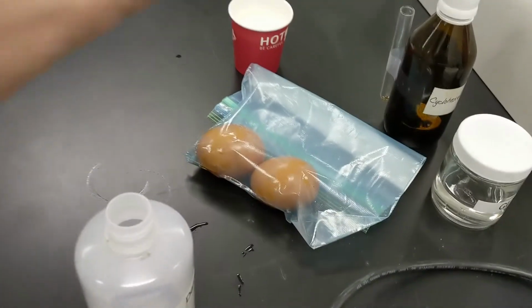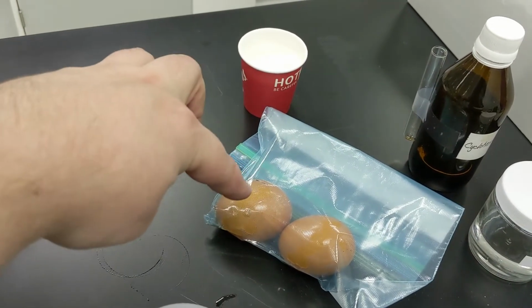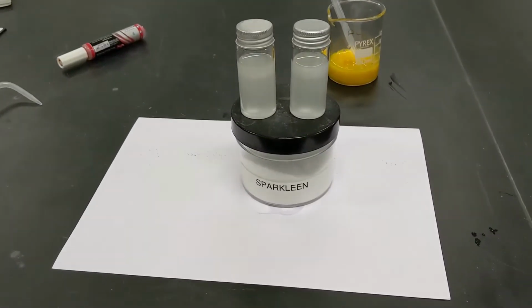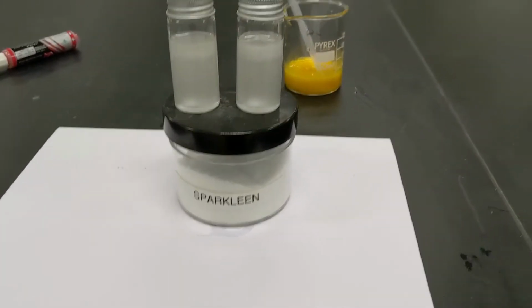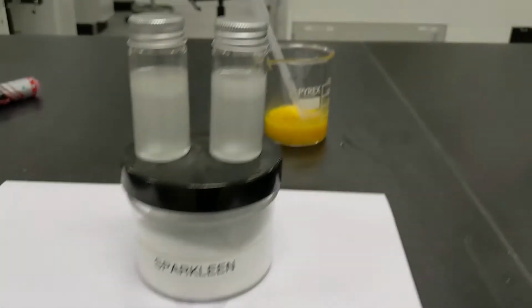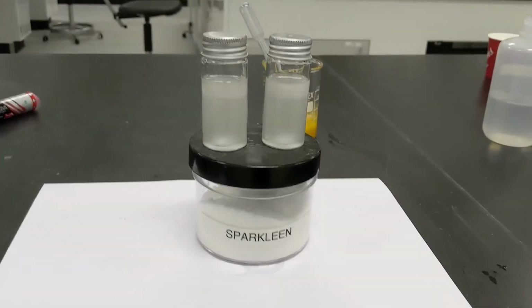So what I'm going to do off camera is I'm going to split these eggs. I'm going to separate them into egg whites and egg yolks, and I'll be right back. Okay, so I have my 2 solutions still. I gave them a little shake. I'm going to mix them with a bit of soap and a bit of egg yolk, and we'll kind of do a little time lapse here.